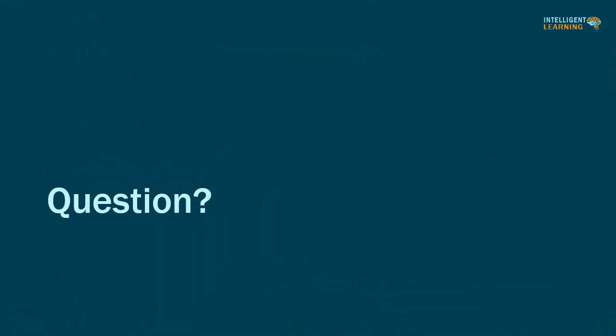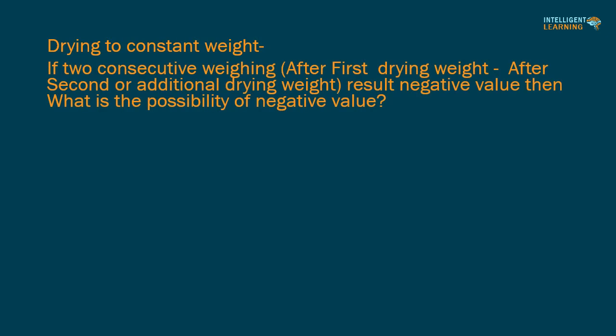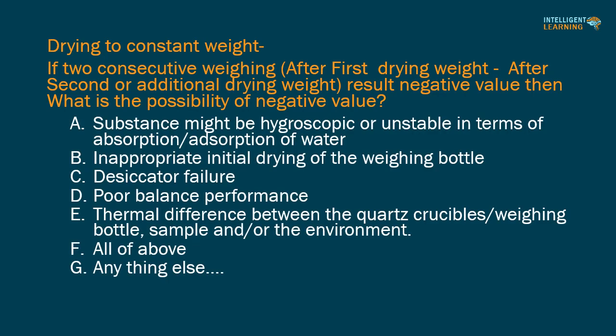Question of this video: regarding drying to constant weight — if two consecutive weighings (after first drying weight minus after second or additional drying weight) result in a negative value, what is the possibility of a negative value? A. The substance might be hygroscopic or unstable in terms of absorption/adsorption of water. B. Inappropriate initial drying of the weighing bottle. C. Desiccator failure. D. Poor balance performance. E. Thermal difference between the quartz crucibles, weighing bottle, sample, and/or the environment. F. All of the above. G. Anything else? Please give your answer in the comment section below.